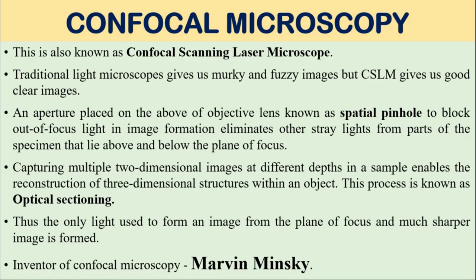What is optical sectioning? Capturing multiple two-dimensional images at different depths in a sample enables the reconstruction of three-dimensional structures within an object. That process is known as optical sectioning in confocal microscopy, or in the confocal scanning laser microscope. Thus, the only light used to form an image is from the plane of focus, and a much sharper image is formed. Here, a much sharper and better image is formed when compared with normal microscopes.